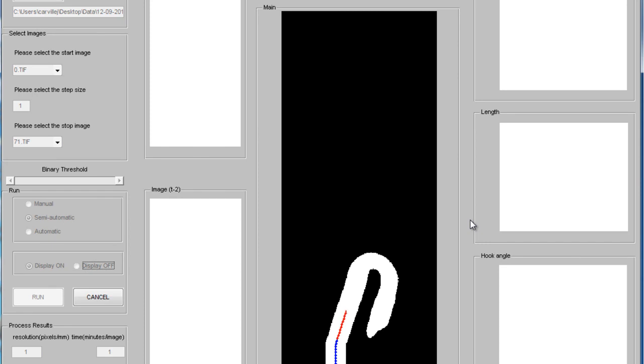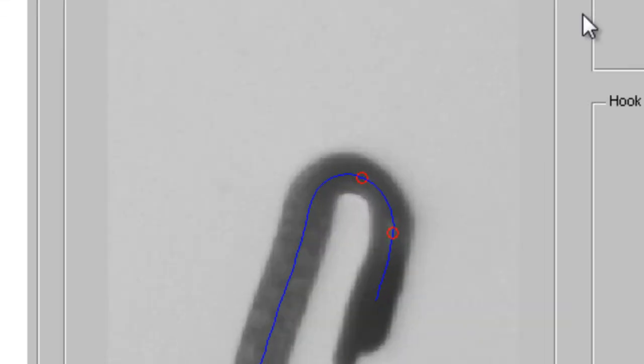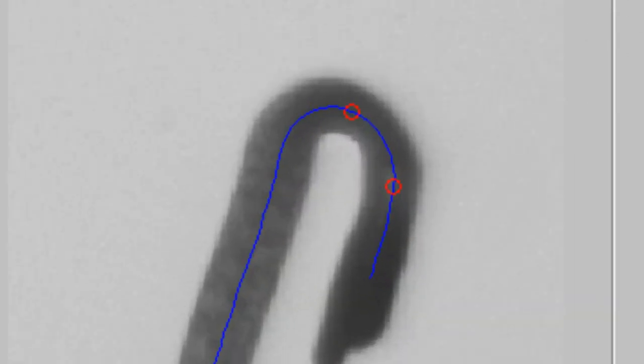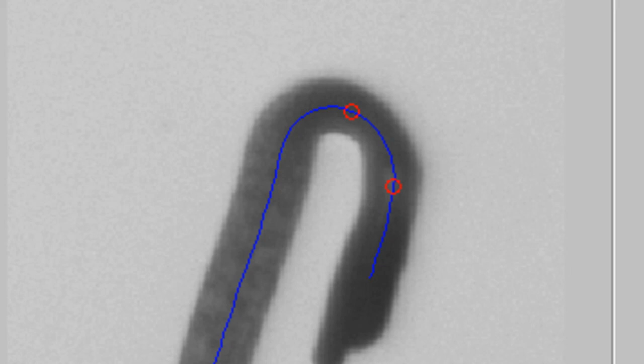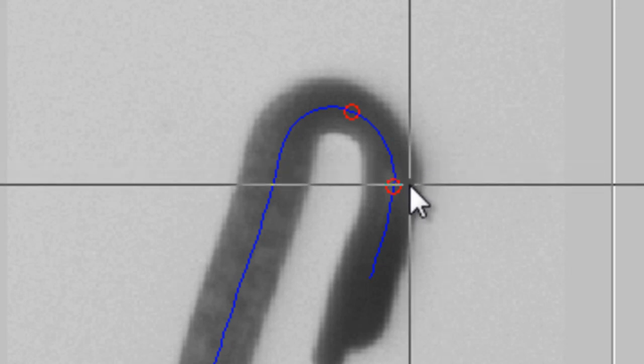The program will begin to run immediately following this selection. Hypotrace will prompt you to make endpoint selections. Multiple red circles will be displayed, indicating various points the program has identified as possible endpoints of the hypocotyl. Click on the point that most accurately identifies the apical meristem.